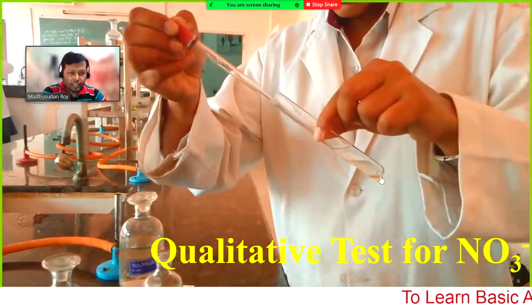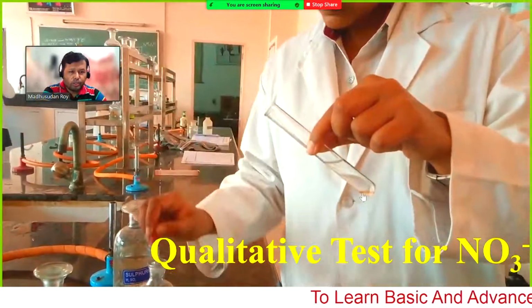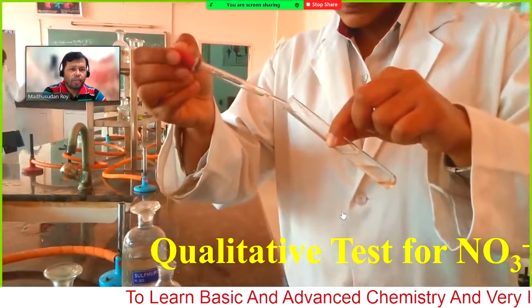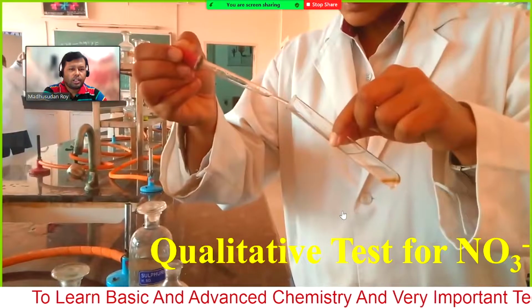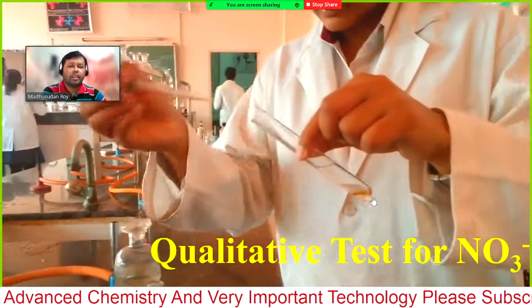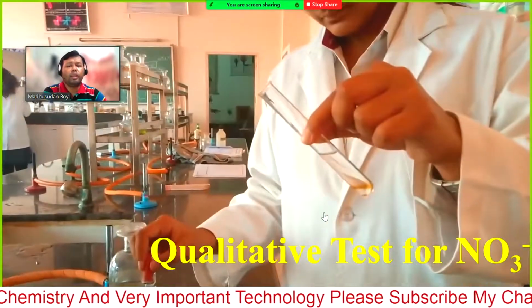Now you can see some brown color is forming, so we need to add a little bit more. I have mentioned we should add 2 milliliter, but here they have added maybe around 1 milliliter.